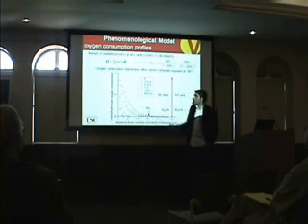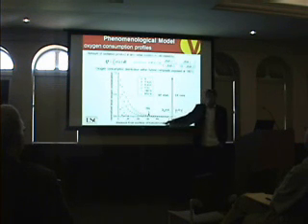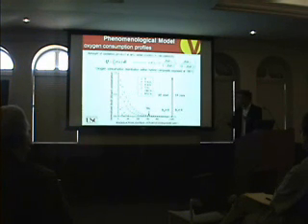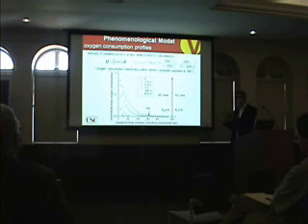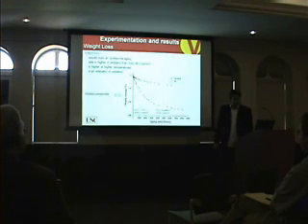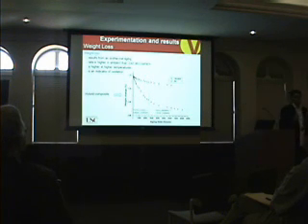And as you see, this is exactly almost the same as the other one, and this is the oxidation product. This is the normalized oxidation product. And at this point, you don't see any oxidation product. So this is the thickness of the oxidized layer from the surface up to here. By using this model, we predicted the thickness of the oxidized layer. Now we have to experimentally measure the thickness.